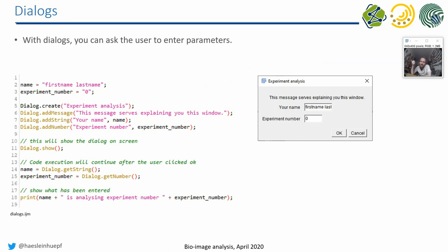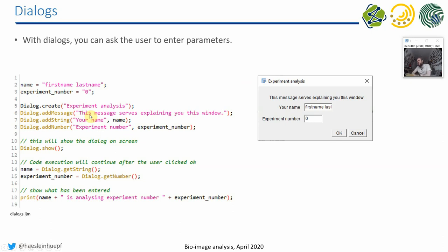but you also want to save who did the analysis and, for example, the experiment number. And you can put these two things together in a dialogue where you say, okay, first of all, we create a dialogue. The dialogue has a certain headline we again find here. Then we give an additional message where we explain a bit what this dialogue is for and what the user is supposed to enter, just to give some hints to program a good user interface with documentation.